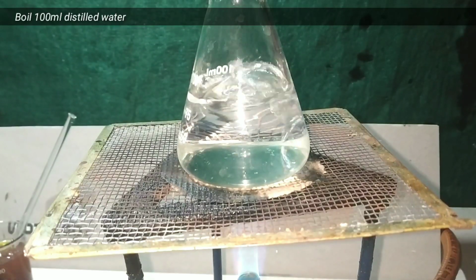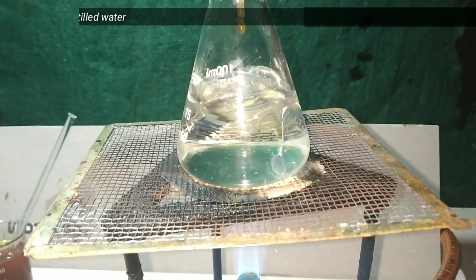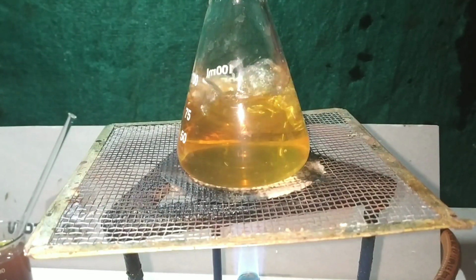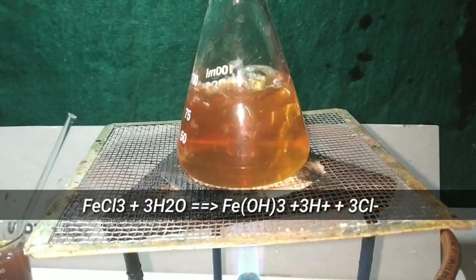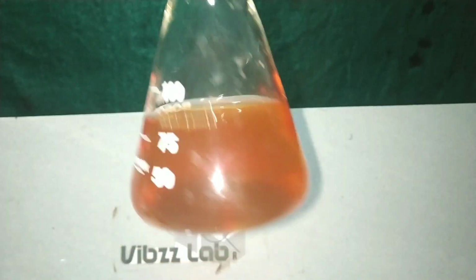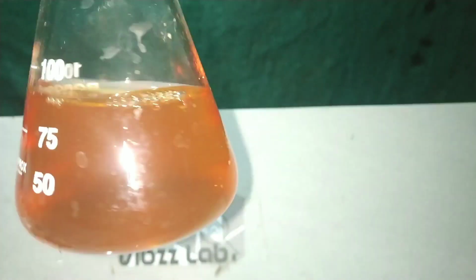Now we take another 100 milliliters of distilled water in an Erlenmeyer flask and boil it. Then we dropwise add the iron 3 chloride solution which we just prepared into it. What's happening here is that iron 3 chloride is getting hydrolyzed to form iron 3 hydroxide. Continue adding the iron 3 chloride solution dropwise until a deep brown color is formed, and here we have the ferric hydroxide sol.